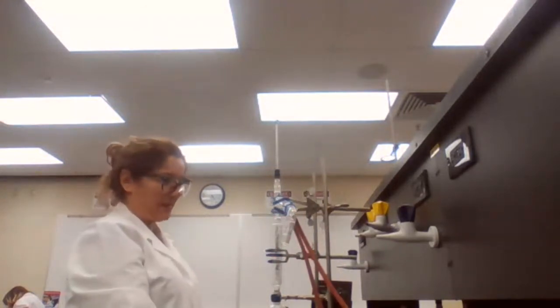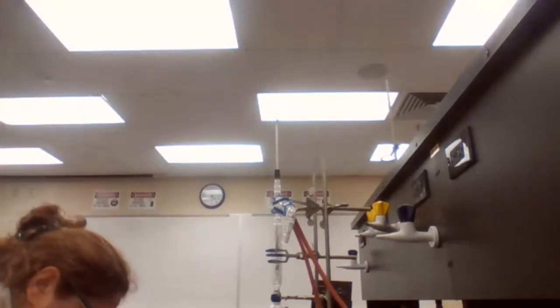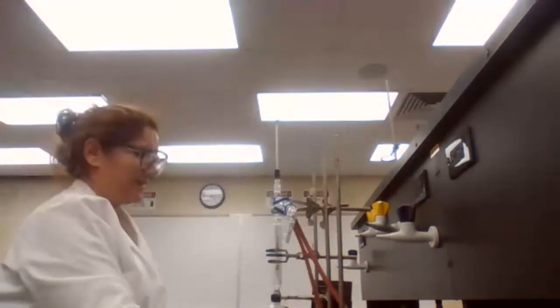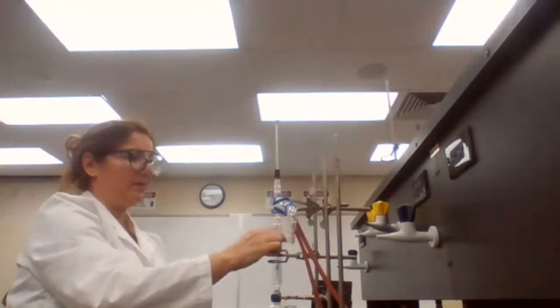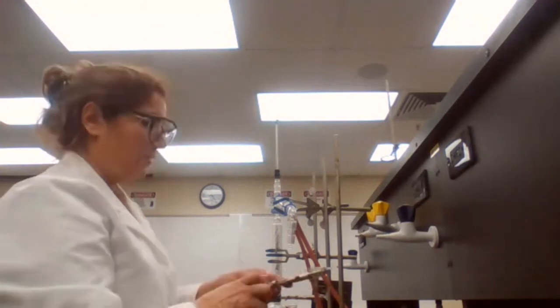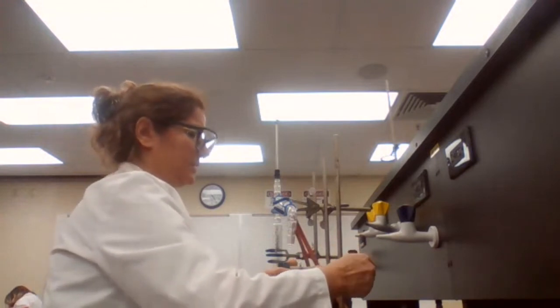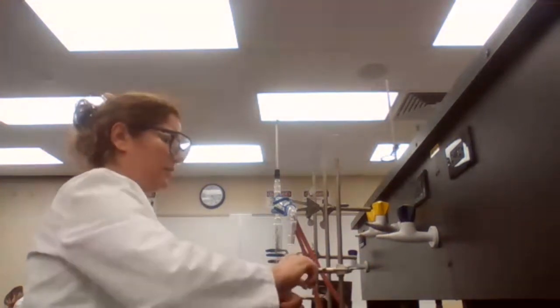Okay, this setup is done so far, except for the graduated cylinder, because as I said earlier, I don't want my graduated cylinder to be all the way down here, with the drops coming all the way down, where it can vaporize again or I can lose the compound. So I'm using another utility clamp to hold the graduated cylinder up.